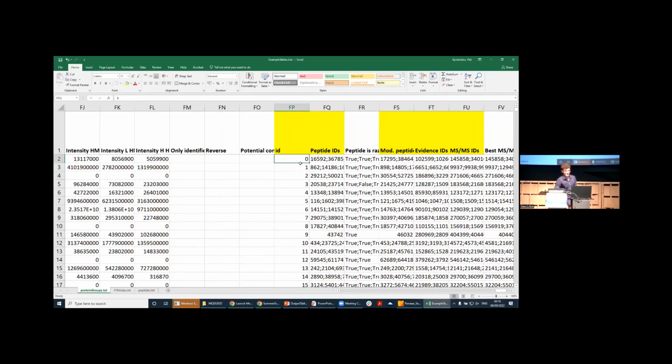So what we do here is just match to which row in other tables we should match our protein group here, for example, to which rows in the peptide table, basically. So we had seen before that there were 4 peptides involved in this protein group. So we have now here 4 peptide IDs that we might look at in the peptide table if we want to. So that's basically just how you can reference from one table to the other one.